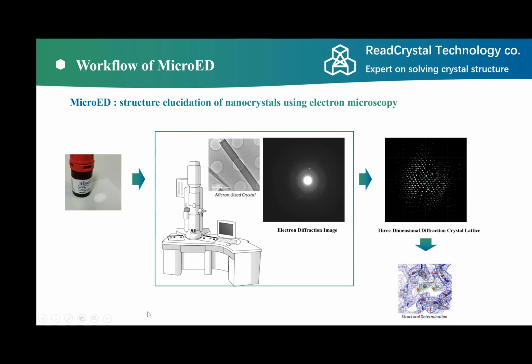This is a nanocrystal in the TEM, which you often see during the measurement. Then you can select the crystal and collect data from this single crystal. Here is the diffraction pattern collected from the crystal.